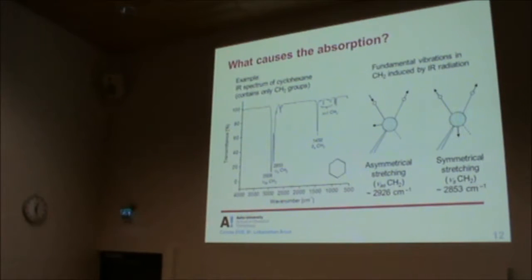But if you take this molecule and record a Raman spectrum, then most likely, it may not be true, but most likely this intensity will reverse. This, which gives a very strong peak in infrared spectroscopy, will be weak in Raman spectroscopy. Okay, maybe this will be the wagging and the twisting.